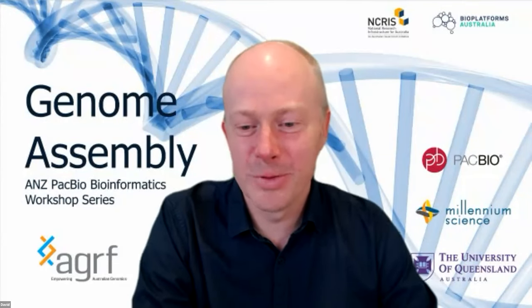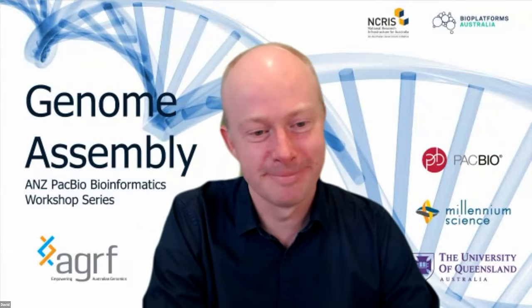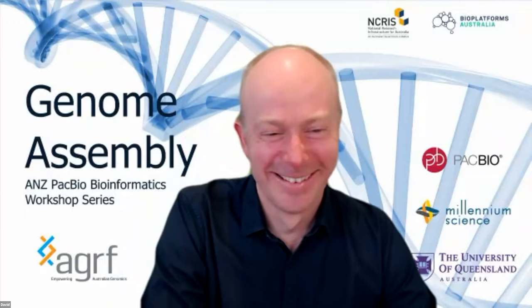Excellent. Zue asks, have you considered using PacBio IsoSeq for genome annotation? We do use PacBio IsoSeq for MHC regions. MHC is the major histocompatibility complex. You'd think by now, as I work in immune genes, I could say it fast, but I can't. One of our team has just developed an IsoSeq method so that we can get the entire MHC1 gene region in one go with PacBio, which is amazing. It's definitely made Wanwan in our lab a very happy person, because she is the person that usually has to manually annotate it. I think we'll be moving more into IsoSeq.